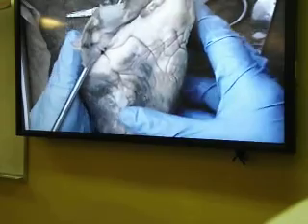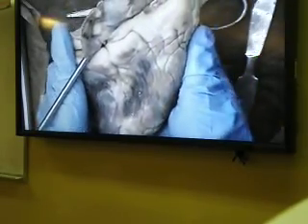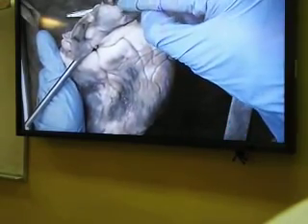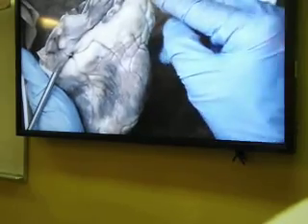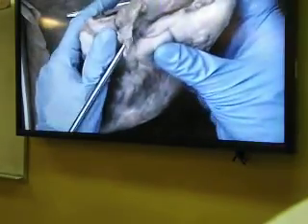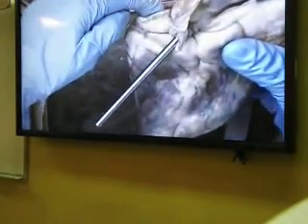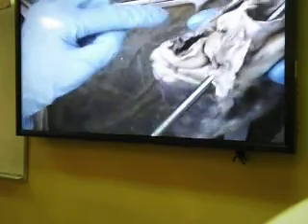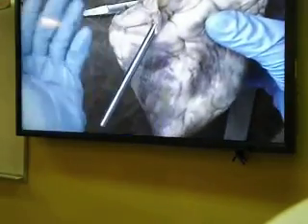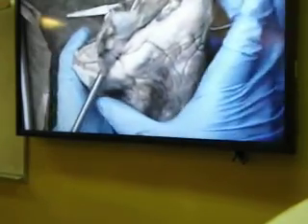So to do so, and we are opening up the right side of the heart first, I come to posterior view. And right here was my superior vena cava. So my first cut will be from the superior vena cava into the right atrium, to the side of the heart all the way to the apex. And my second cut after the first will be from the pulmonary vein, still on the posterior aspect, through the left atrium into the side of the heart all the way to the apex, connecting with my first cut. That way we will be able to see the valve on both sides pretty well.